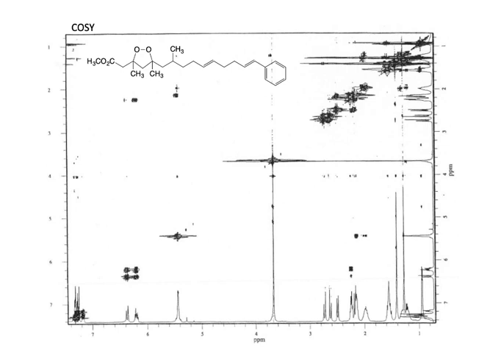In fact, there were 2 different compounds. Well, actually, there were 4. 2 of them had this same general structure, and 2 of them, I think, the chain was shorter or something like that. But 2 of these differed in the stereochemistry here of those where the methyl groups are.